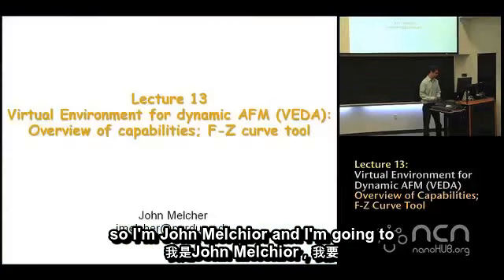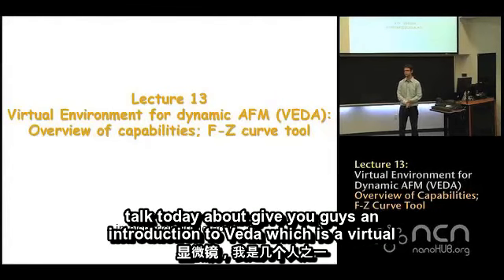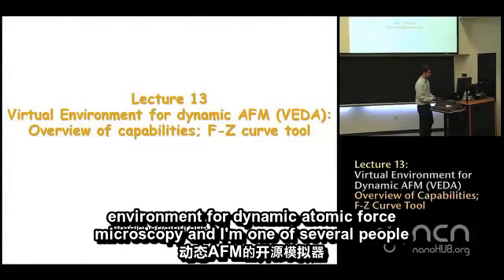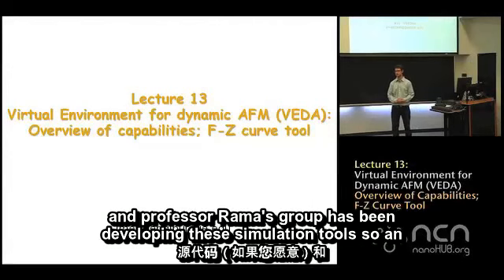nanohub.org. So I'm John Melcher, and I'm going to give you an introduction to VEDA, which is a virtual environment for dynamic atomic force microscopy. And I'm one of several people in Professor Raman's group, which has been developing these simulation tools.